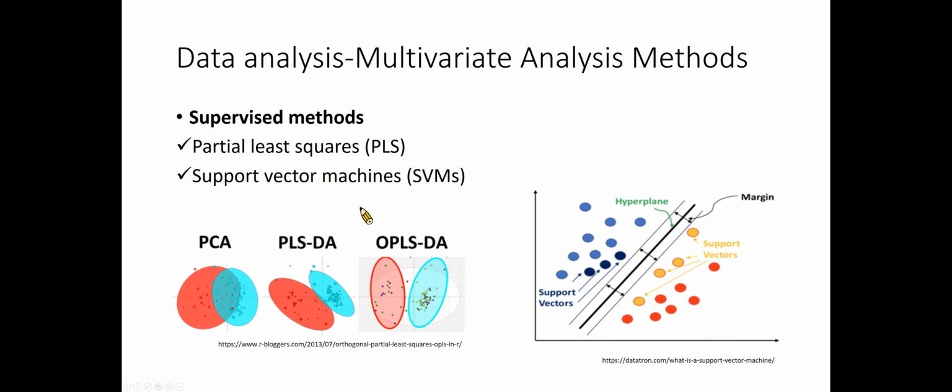In order to deal with this problem, orthogonal PLS was developed. Orthogonal PLS models evolve from PLS models and factorize the data variance into two components: a first component which is correlated with the variable of interest, and a second, uncorrelated component.